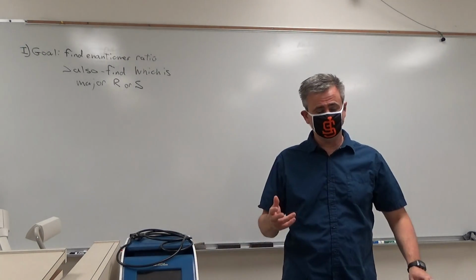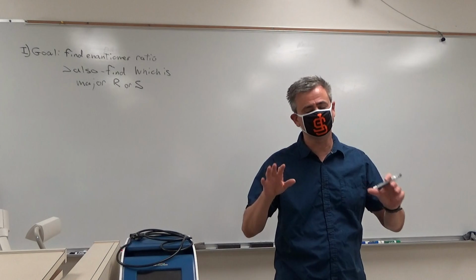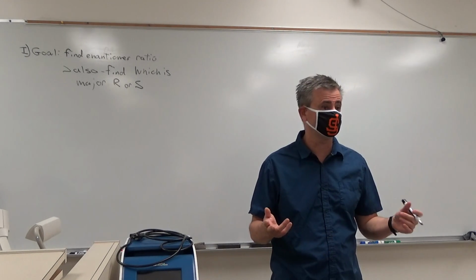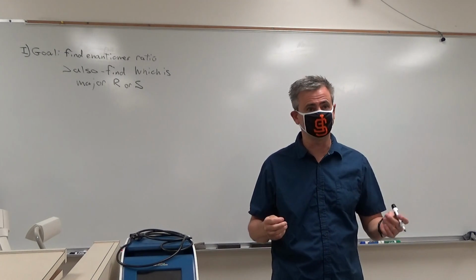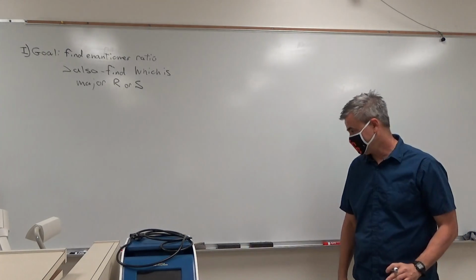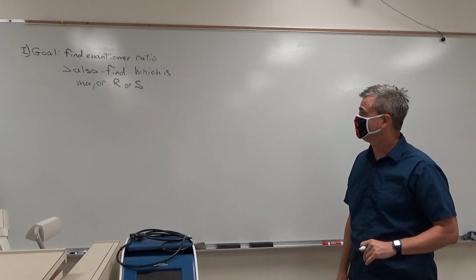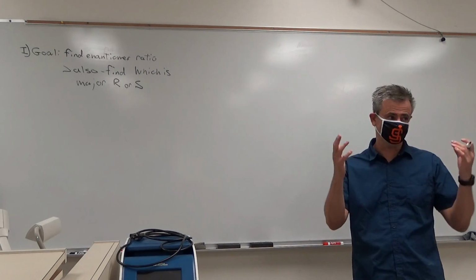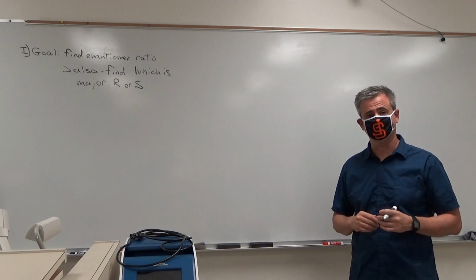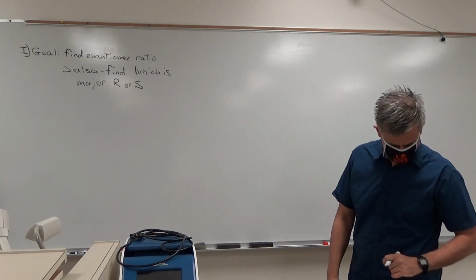Okay, so you might have a ratio of 70-30. Sometimes for this experiment, the ratios are pretty poor. Like I said, this is not really fancy chemistry that would give you much better selection. But again, that's a reflection of the type of experiment, not the experimenters, not the scientists who did it. Okay.